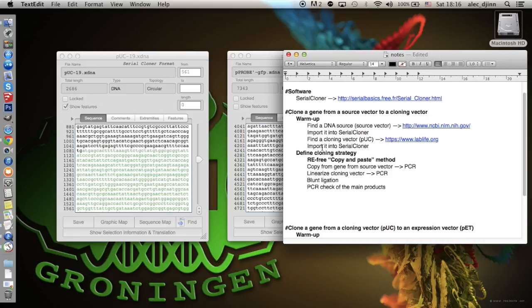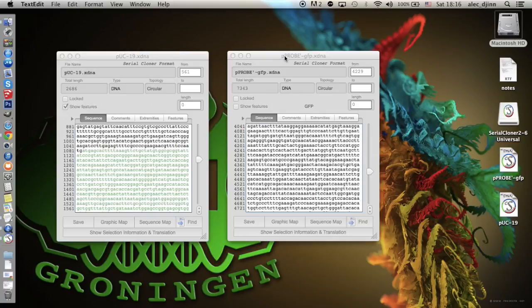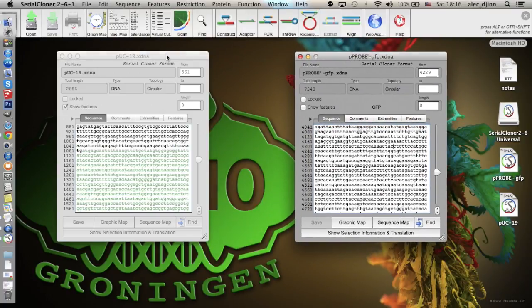This is the end of the first part of the tutorial. In the next part, we're going to simulate step-by-step a restriction enzyme-free cloning experiment using the Serial Cloner software and the files we just prepared.